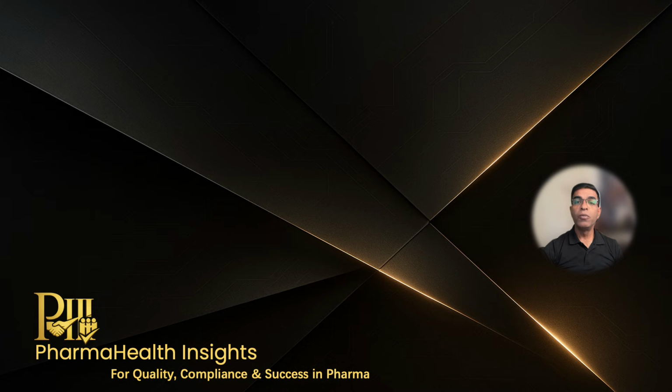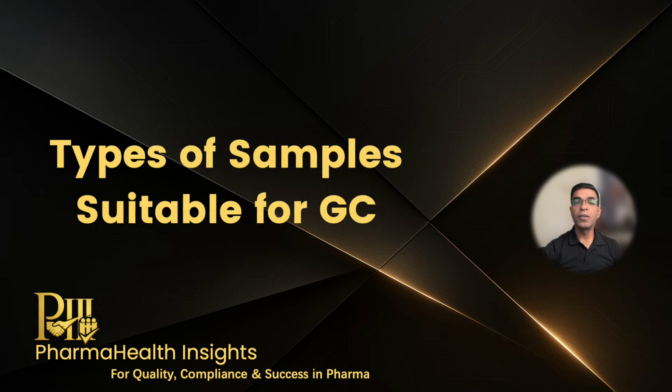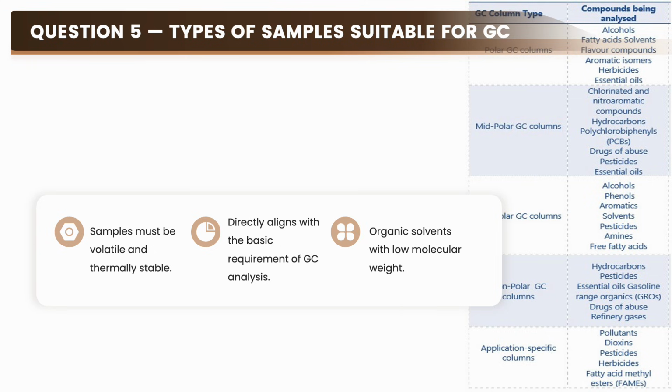Now the interviewer will move towards sample related questions. What type of samples are suitable for GC analysis? You should answer like this. Samples suitable for GC must be volatile and thermally stable. Only compounds that can be converted into vapor without decomposition can be analyzed using GC. When you give solvent examples, it shows that you have practical lab exposure.